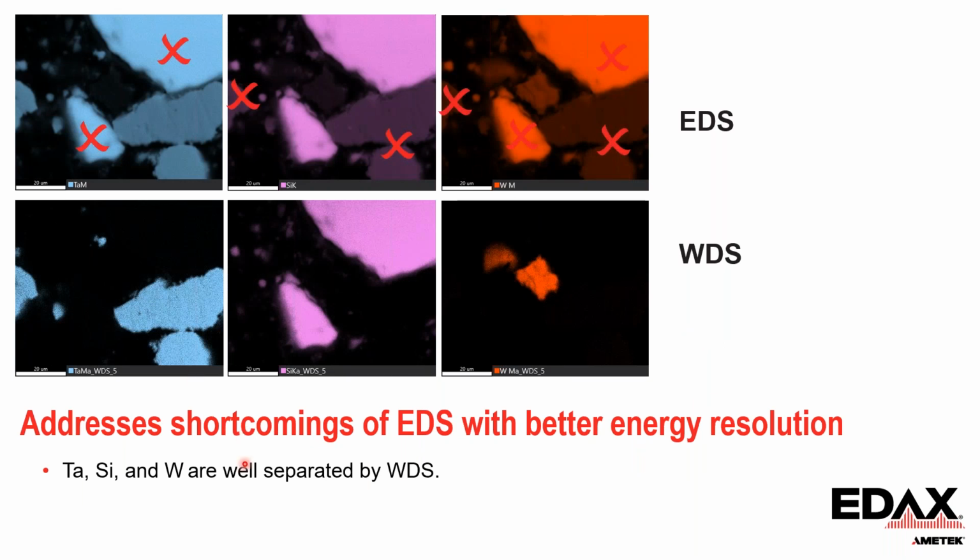These are maps of the three elements I just mentioned above. In the EDS maps, due to the heavy peak overlap, they give us incorrect phase distributions. But in the WDS maps at the bottom, we can see it gives us the correct phase distribution of the three phases. So those overlaps are well separated by WDS.